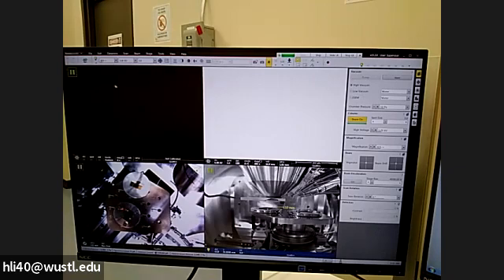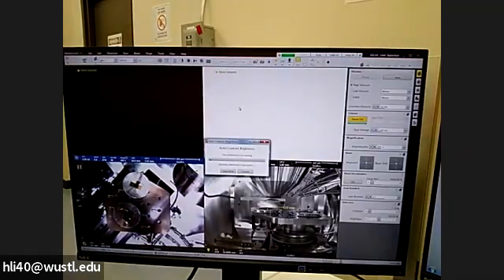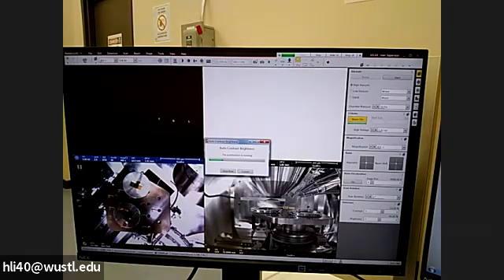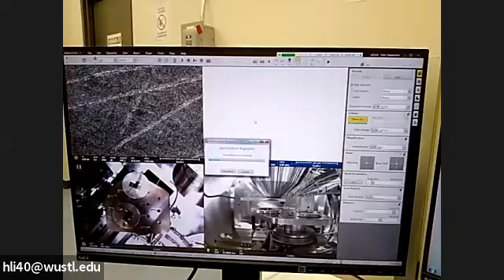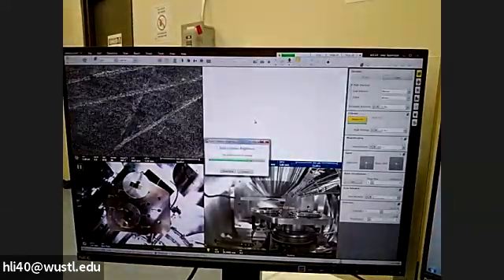If we click the scan button, you will see some features there. If you see all white, the contrast and brightness are not right. If you need to adjust contrast and brightness, you have to highlight that window. Just now, I did not highlight the right window, so it did not adjust the contrast and brightness. I highlighted it now, and it appears blue. Then you just click contrast brightness. You will see something come out.